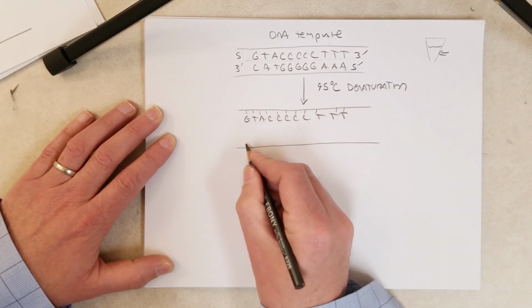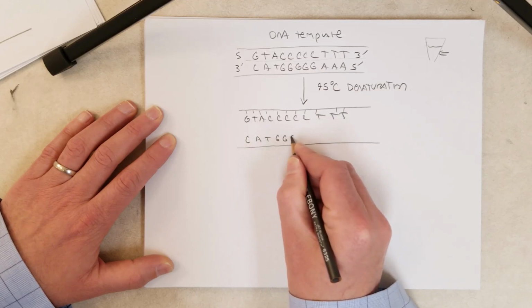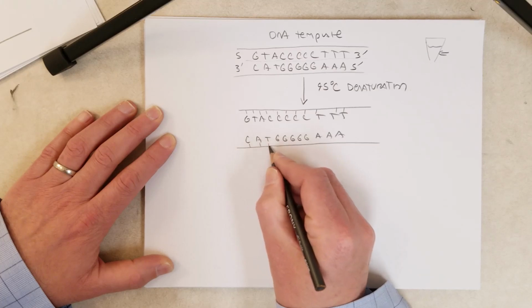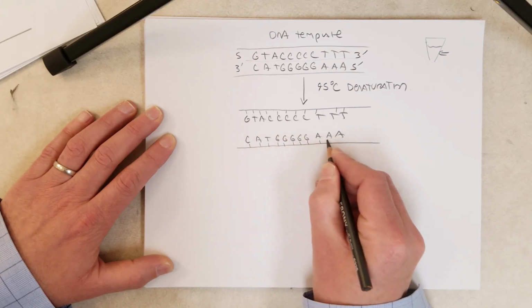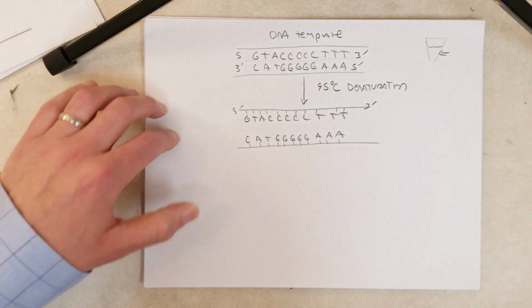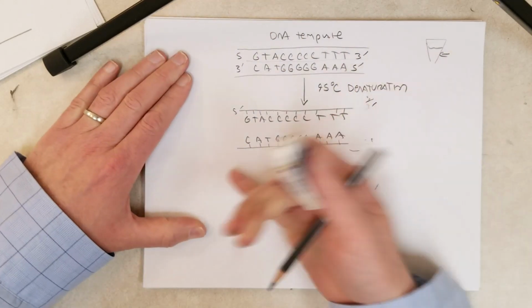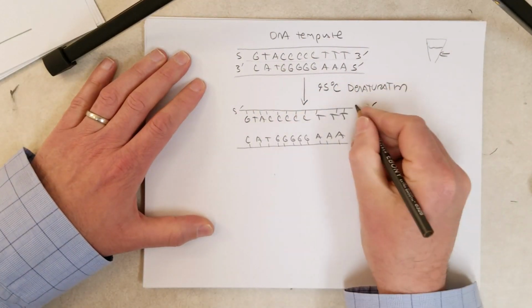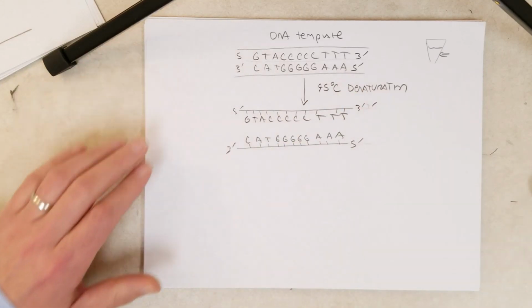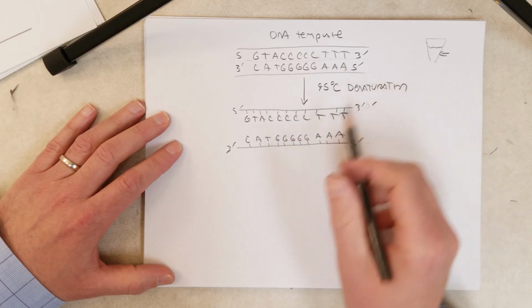So there's one single strand here, and there's another one here, and these separate and they float through the solution. And they have 5' and 3' ends, so those won't change. Made the backbone a little too long there. Okay. So we've denatured all the copies of the template, and they're floating in the liquid here.